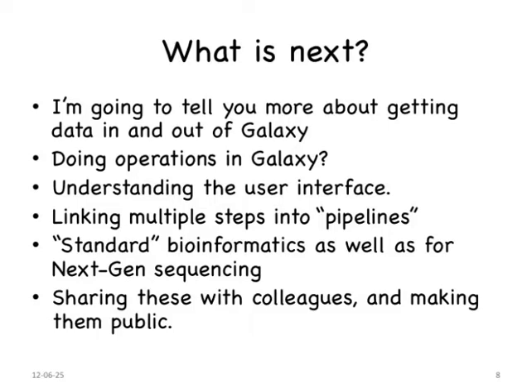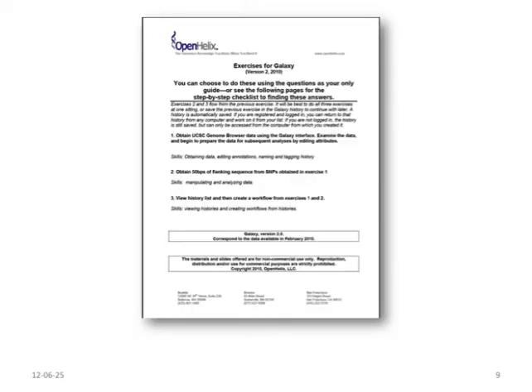We're going to talk about getting data in and out of Galaxy, doing operations in Galaxy, understanding the user interface, linking multiple steps into a pipeline, and doing sort of standard bioinformatics as well as next-gen sequencing bioinformatics, and sharing these. So there's this lab that's a separate two-pager that's in your handout.